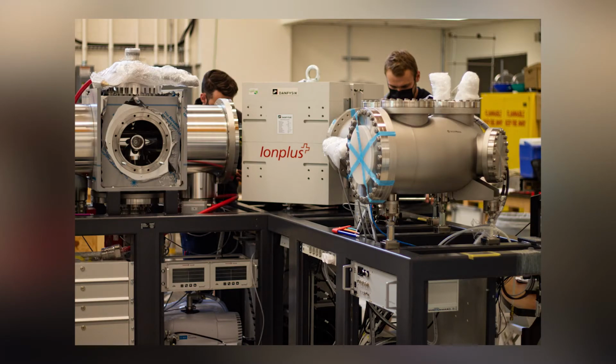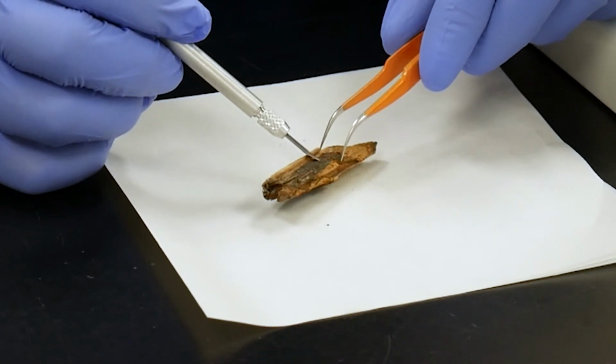But then that puts the onus on the archaeologist, because you have to really know what you're dating and why and what time that carbon is going to represent. So if you're dating an individual seed, you need to know what that individual seed is going to tell you. Other things that we'll be able to date are forams, very small forams from marine cores. We could date museum specimens that were previously too precious to have destructive analyses done on them. Human bone is another one, because we have to be very sensitive around how much material is taken from a human bone. So we're going to have many new capabilities with this mini carbon dating accelerator. And we'll be able to do things like dating individual compounds or isolating things like DNA for radiocarbon analysis. So it's going to be a very exciting decade, I hope.